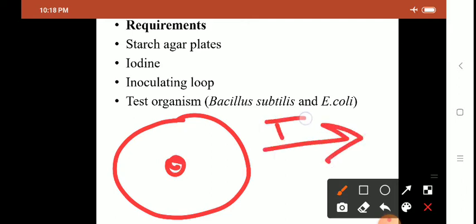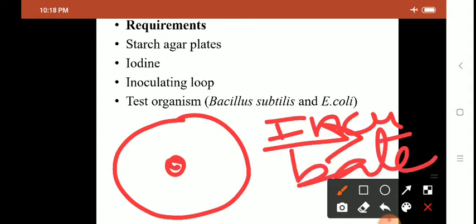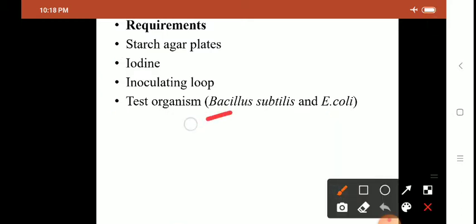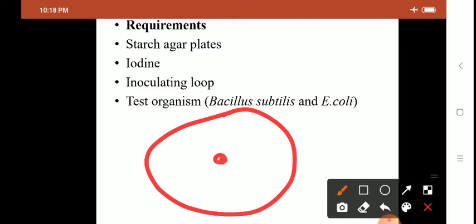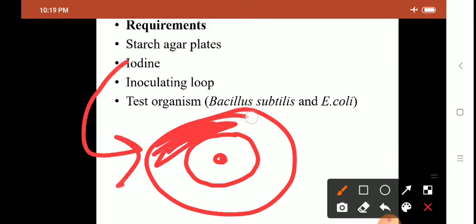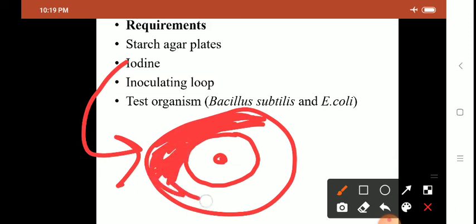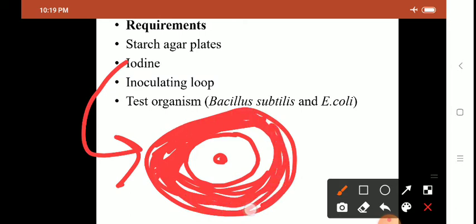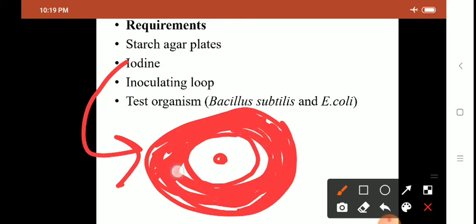After spot inoculation, incubate the plate at 37 degrees Celsius for 24 hours. After 24 hours, add iodine into the plate. If the organism produces enzyme amylase, enzyme will be released in the surrounding of the colony and starch will be hydrolyzed in that area. When you pour iodine into the plate, the rest of the plate will turn dark blue or violet. There will only be a clear zone of starch hydrolysis surrounding the colony.